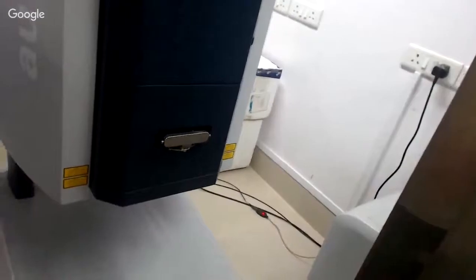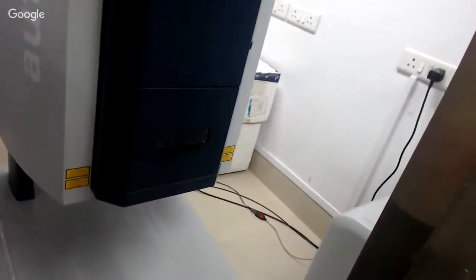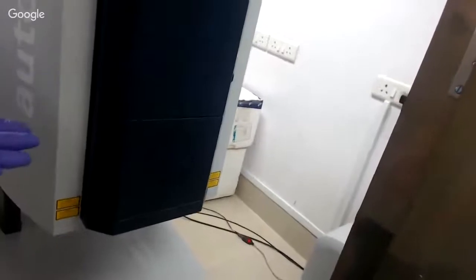So here you can see now the plate is going inside. Once the plate is inside, it will start to create the vacuum. Then we can start the analysis.